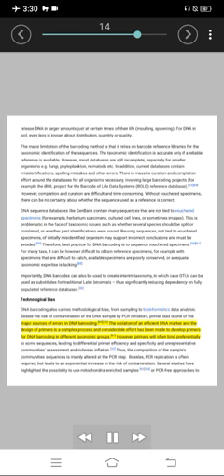The isolation of an efficient DNA marker and the design of primers is a complex process, and considerable effort has been made to develop primers for DNA barcoding in different taxonomic groups. However, primers will often bind preferentially to some sequences, leading to differential primer efficiency and specificity, unrepresentative community assessment and richness inflation. Thus, the composition of the sample's community sequences is mainly altered at the PCR step.